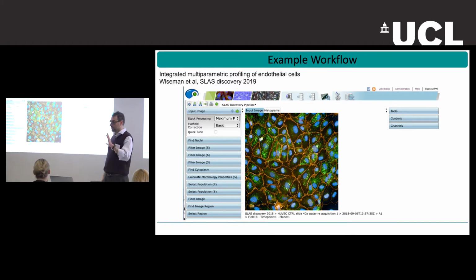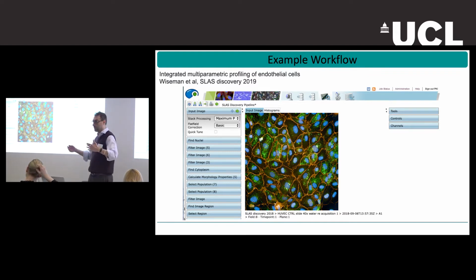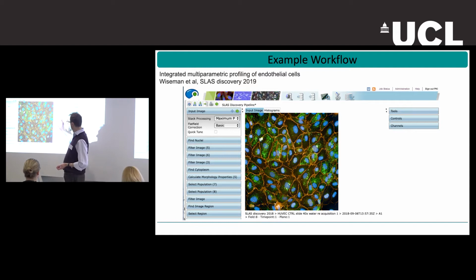When we talk about endothelial cells, this is biologically relevant because endothelial cells need to be closely juxtaposed to do their job. Otherwise, the interface between the blood vessel and the tissue is disrupted, and this is pro-inflammatory, pro-thrombotic, et cetera. So we are very interested in characterizing monolayers of endothelial cells, because it's what I do mostly.